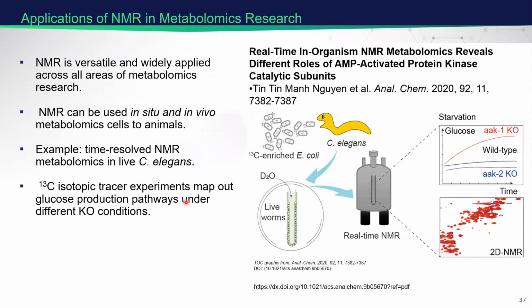So I wanted to showcase some articles in metabolomics or omics research that have an NMR angle, where NMR had a particular advantage to the study. And this first one that I'm showing here just shows the versatility of NMR.